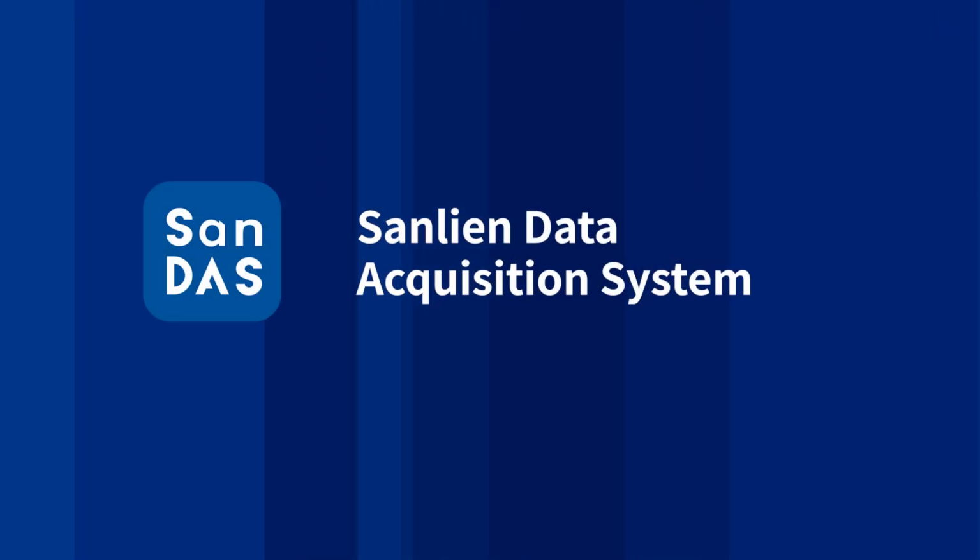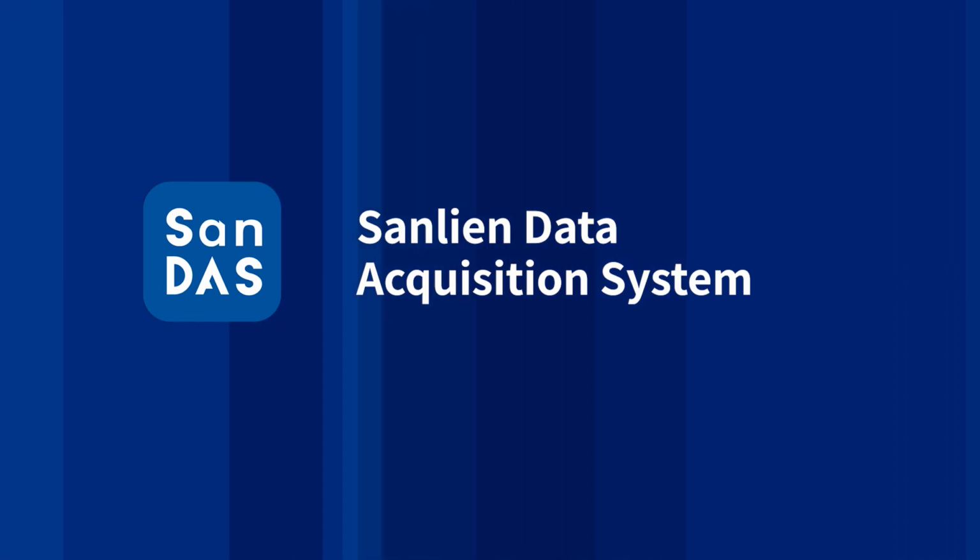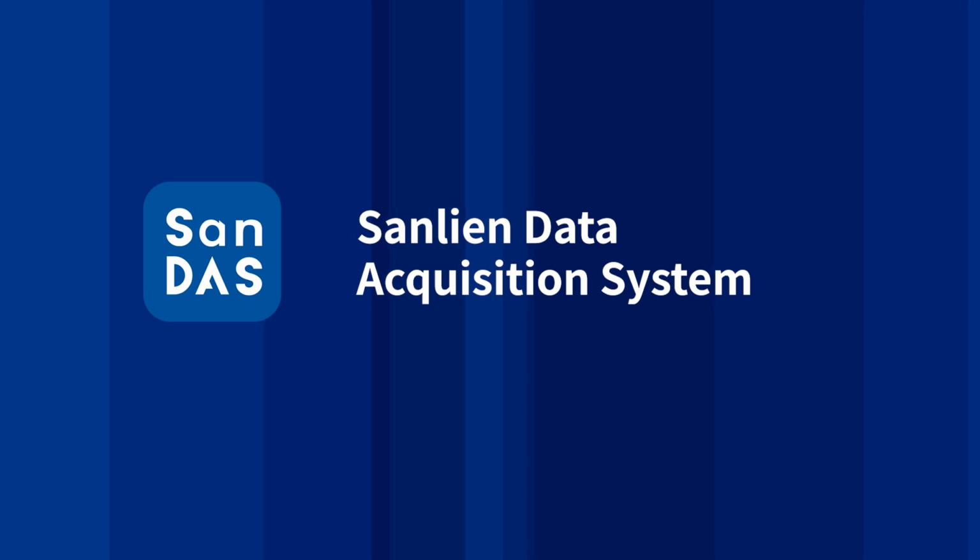We have covered the basics and features of SanDAS. SanDAS provides a comprehensive set of tools for instrument settings, real-time data streaming, data recording, and data analysis.